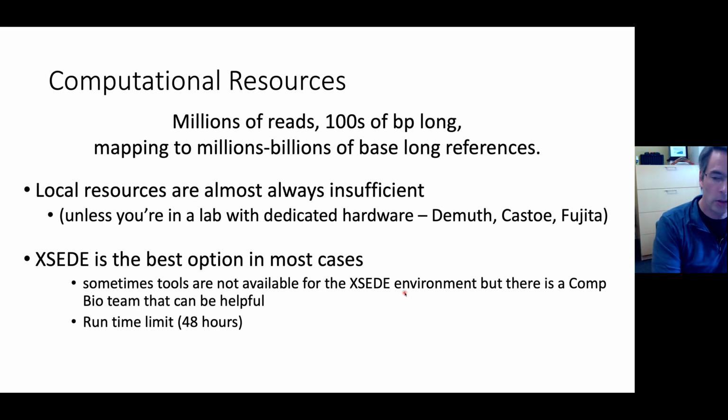That is even an issue in the stuff that we're going to do today, because my favorite software for trimming reads is not on Bridges-2. But the other thing is the runtime, there's a limit of 48 hours. So especially when you're doing genome assembly, which we're not going to do, but if you're working on a vertebrate-sized genome and you want to do assembly, you may need local resources because of the time limits on XSEDE.